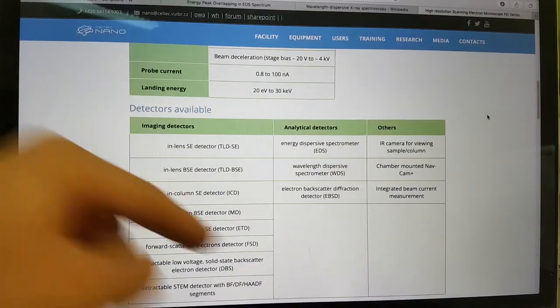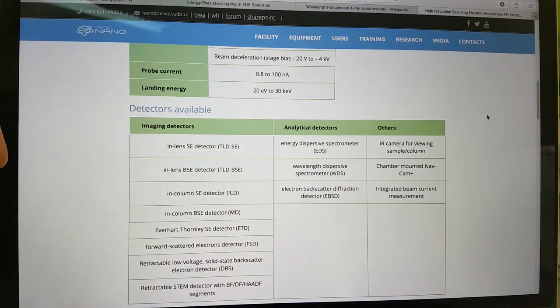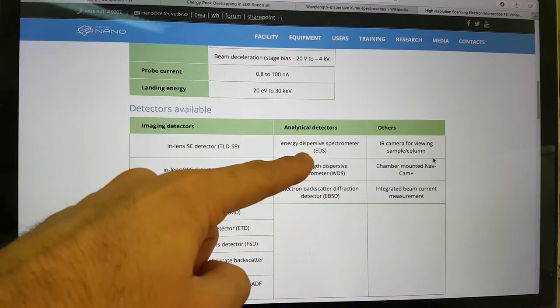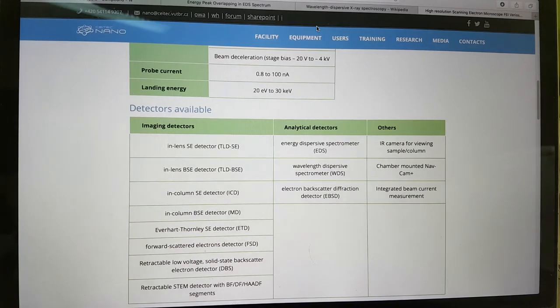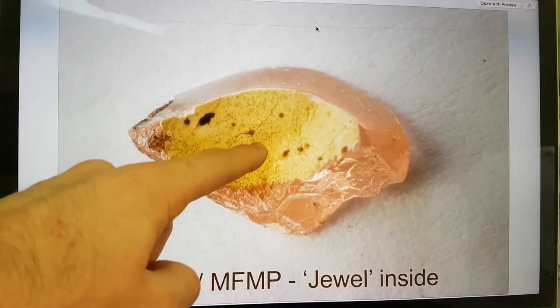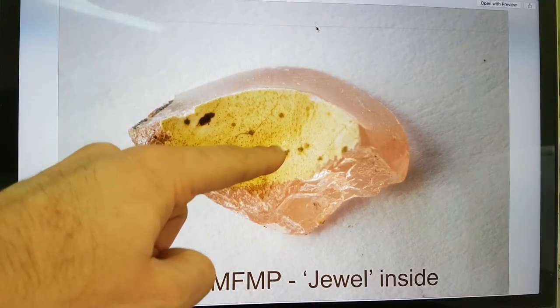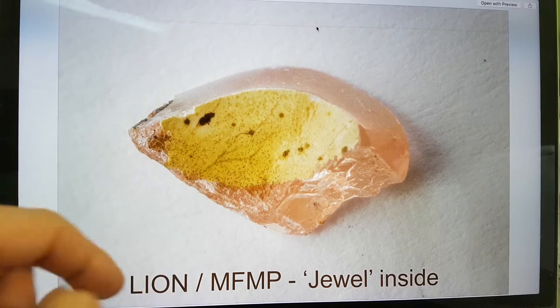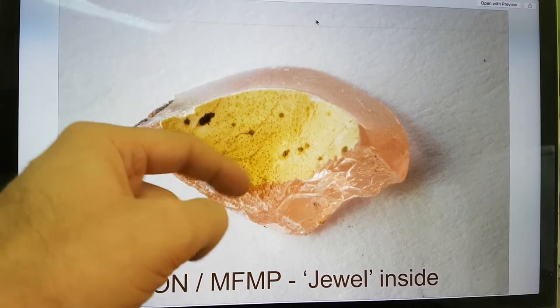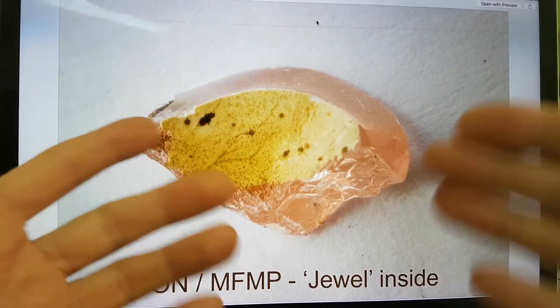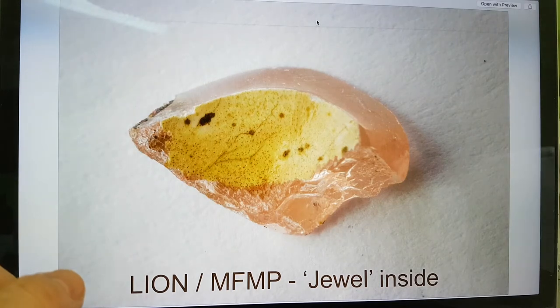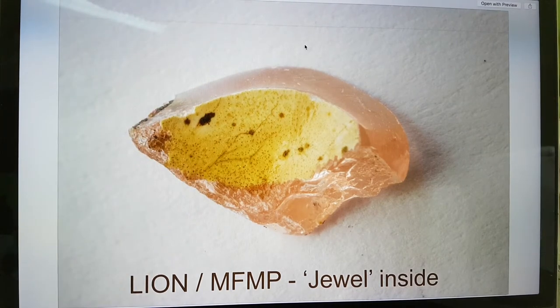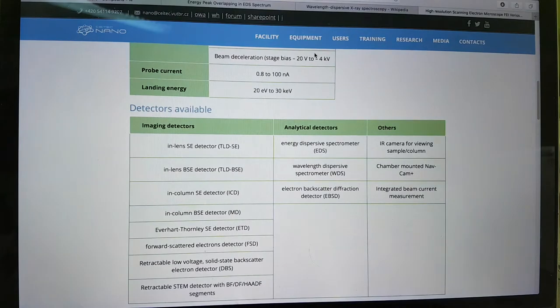And so it can't really determine what that is in this instance. Whereas there's this other technique called WDS, which is wavelength dispersive x-ray spectroscopy. And what this technique does is it actually counts the individual x-rays that come out. And you get much more resolution. So I'm hoping that we will be able to use this scanning electron microscope at Cytek Nano in Brno. And this has a wavelength dispersive spectrometer WDS attached to it. So we should be able to go back and look at this encrustation and determine whether it really does have any tungsten. And that would be very interesting because, according to the analysis of the starting materials, there is no tungsten in the reactor.